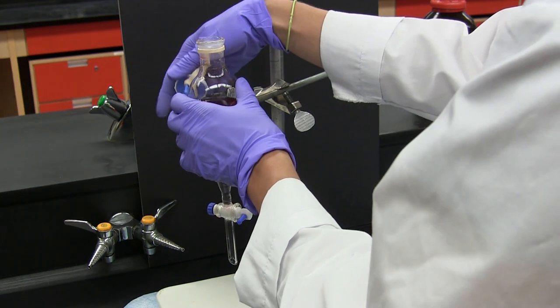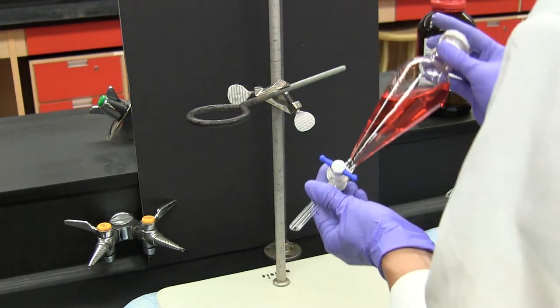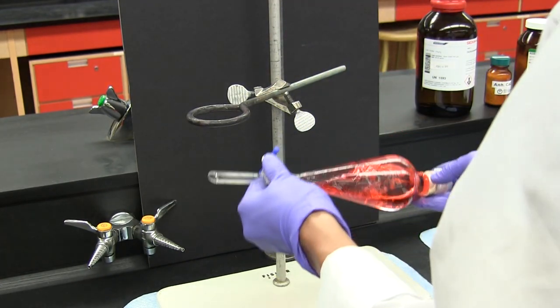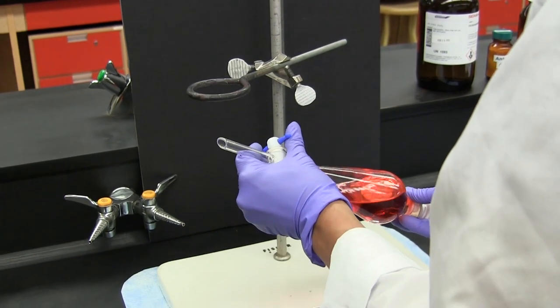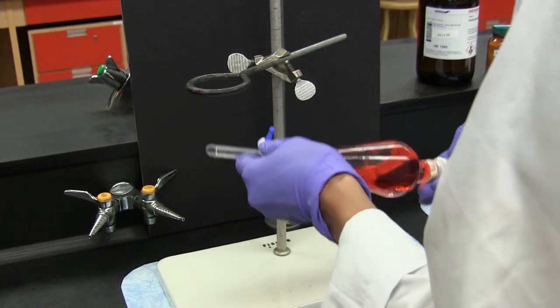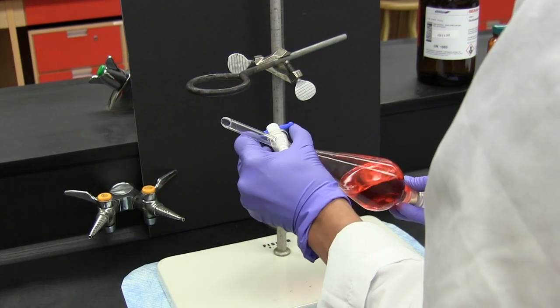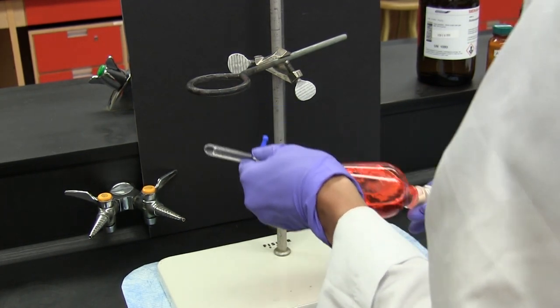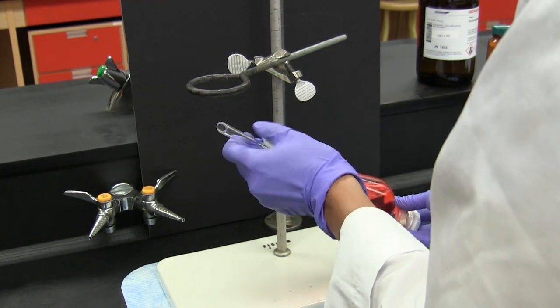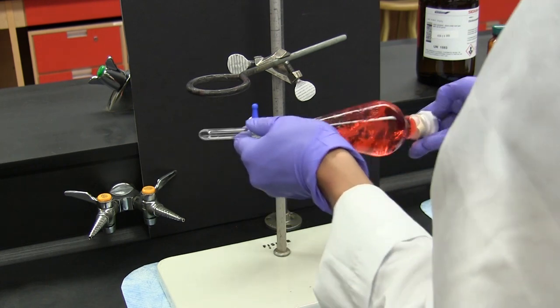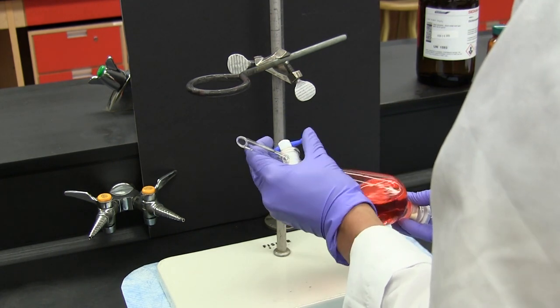The stopper is now placed in the neck of the sep funnel. It's important for you to not allow the stopper to fall out at any time while you are handling the apparatus. Hold the stopper with one hand and carefully invert the apparatus. Now gently shake the sep funnel while periodically opening the stopcock to relieve the buildup of pressure. This is repeated several times to ensure that the two layers are thoroughly mixed, allowing the solute to transfer from the water into the dichloromethane.